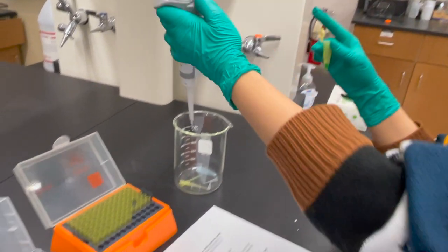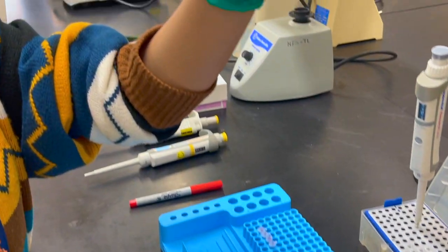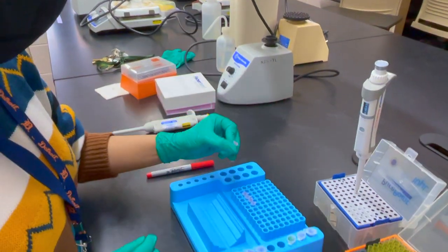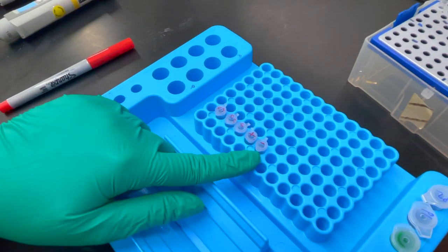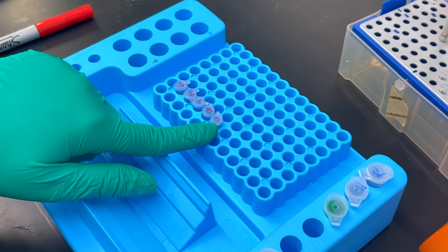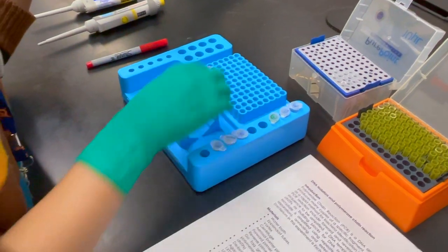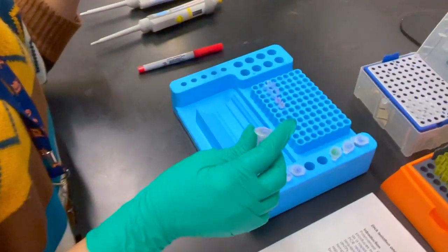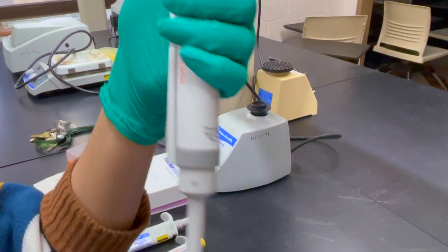We have added 20 µL of master mix into each of the five tubes. The tubes are labeled S1, S2, and S3 for the three sample replicates, plus a positive control and a negative control. The sample tubes are triplicates of the same E. coli DNA sample, and the negative control tube will receive water instead of DNA. Now we add the E. coli DNA to the respective sample tubes.